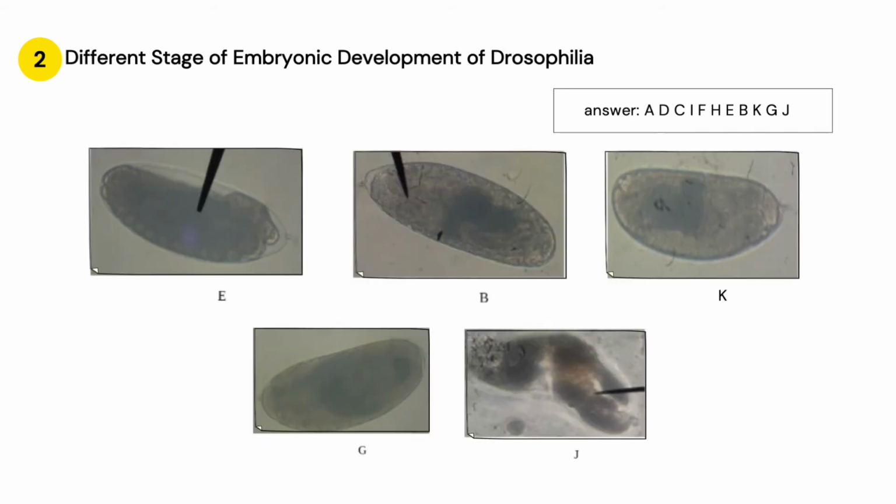To continue, development proceeds with germ band extension, where invagination of the hindgut can be seen dorsally, and then the stomodeal invagination, where invagination of the stomodeum can be seen ventrally, and then shortening of the germ band, where hindgut and foregut invagination are deep. Next is the shortened embryo, where the hindgut is now fully posterior. Consequently, the dorsal closure, where the ectoderm closes dorsally, the midgut broadens and the head involutes. Lastly, the condensation of the ventral nervous system, where the gut regions are joined and then the nervous system forms ventrally.